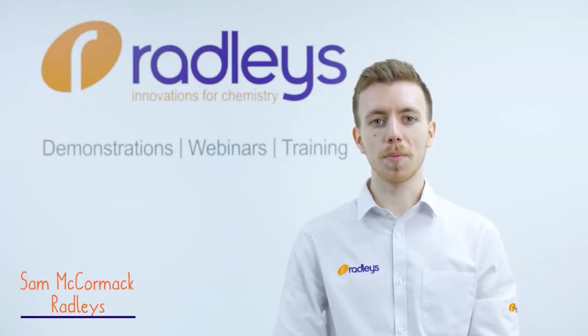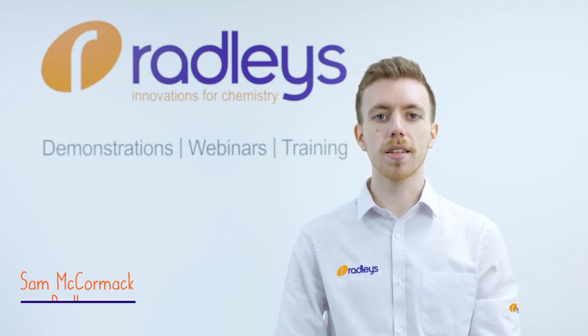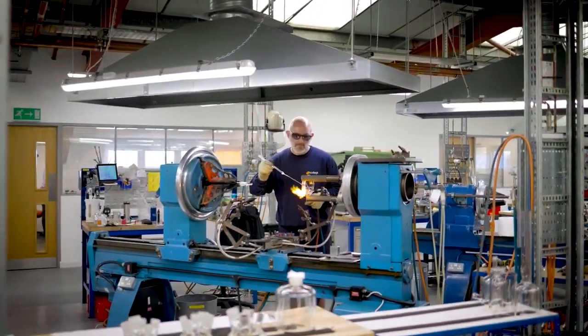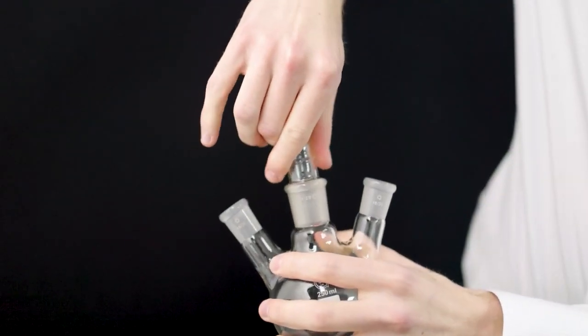Here at Radley's, we've been scientific glassblowing right here in the UK since the 60s, so we're in the perfect position to help you with your glassware queries. In this video we're going to share our tips for how to unstick a ground glass joint.